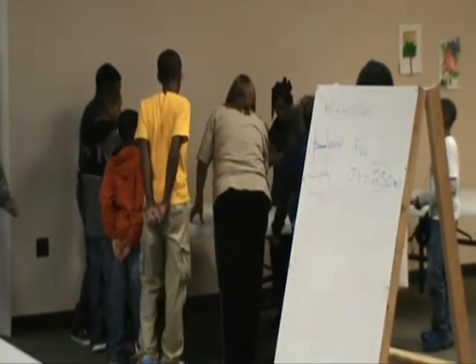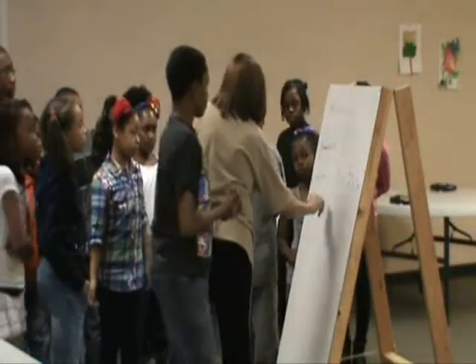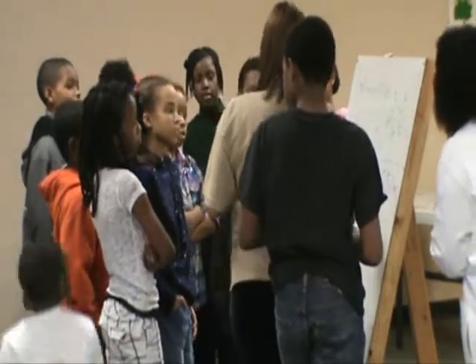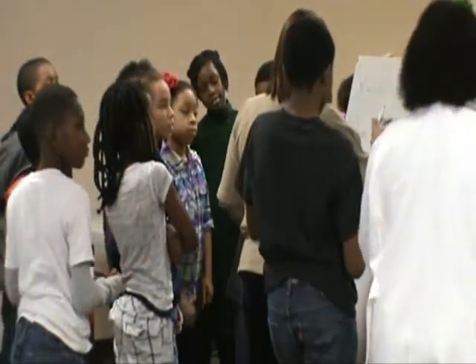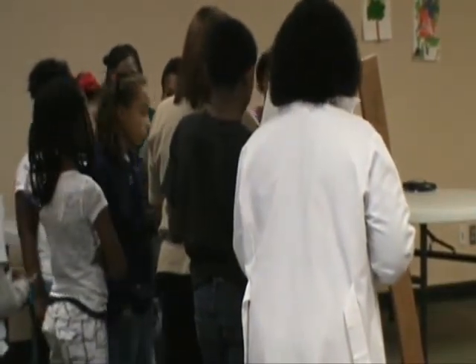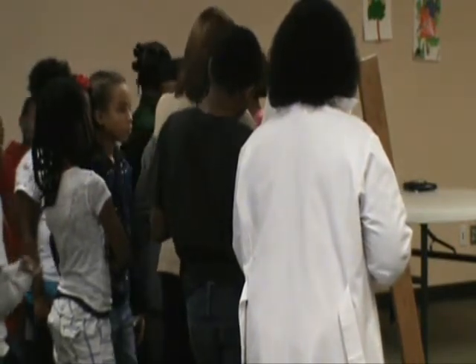31.31. Now, is this balance more accurate than the other one? You know, you guys are awesome. This balance was 30, 1, 10, and this is what? Tenths. No. Listen, to the right of the decimal are your tenths. Ones, the smallest being. Tens. T-E-N-T-H. That balance is what? 31.31. So what comes after tenths?